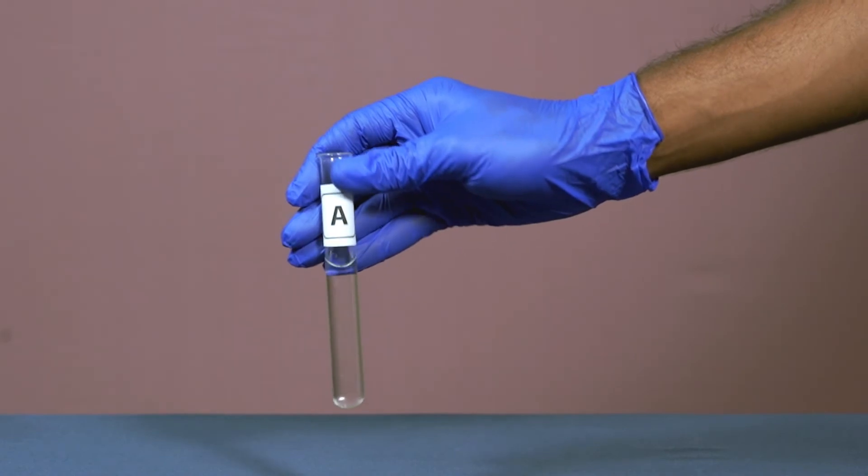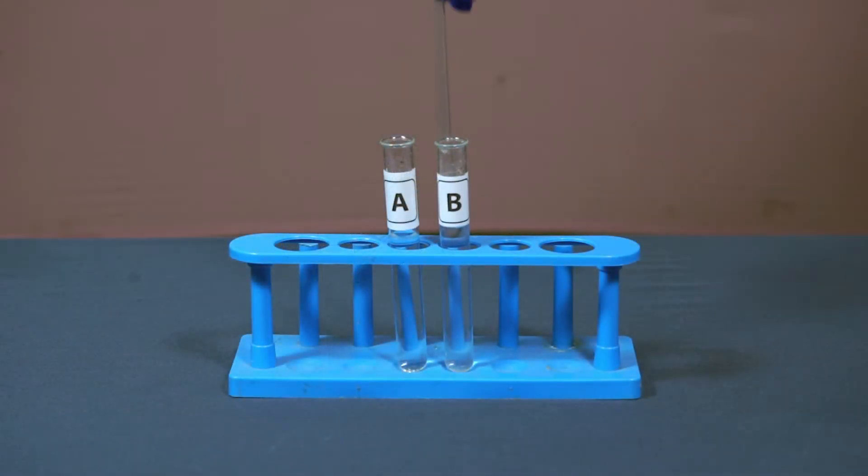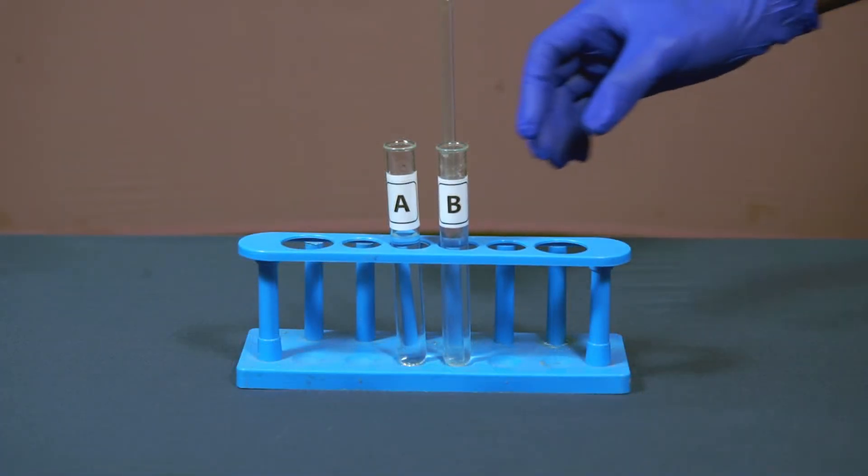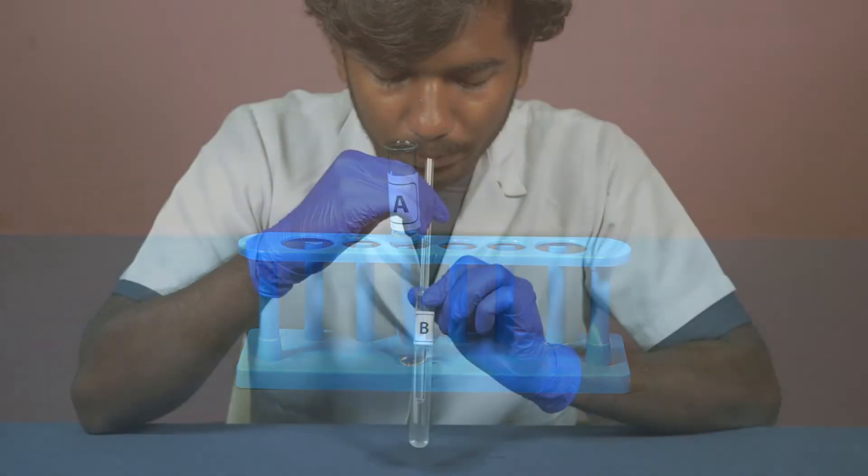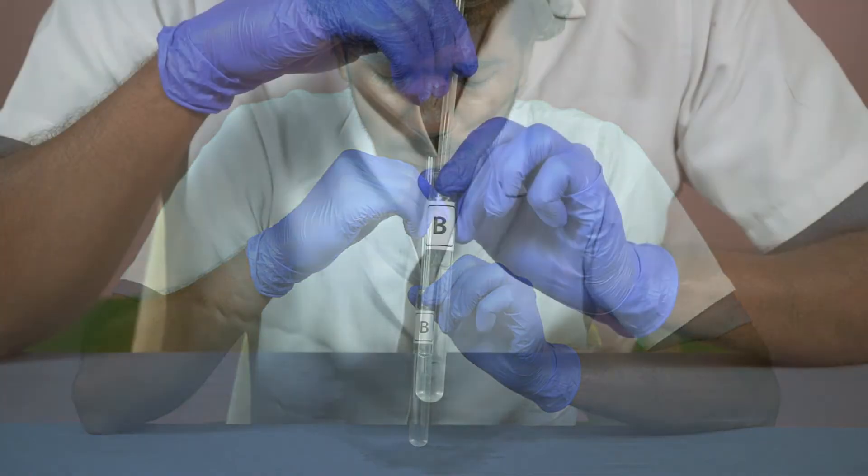Shake the test tube. Place the glass tube straw into test tube B. Now blow air into test tube B for two to three minutes.